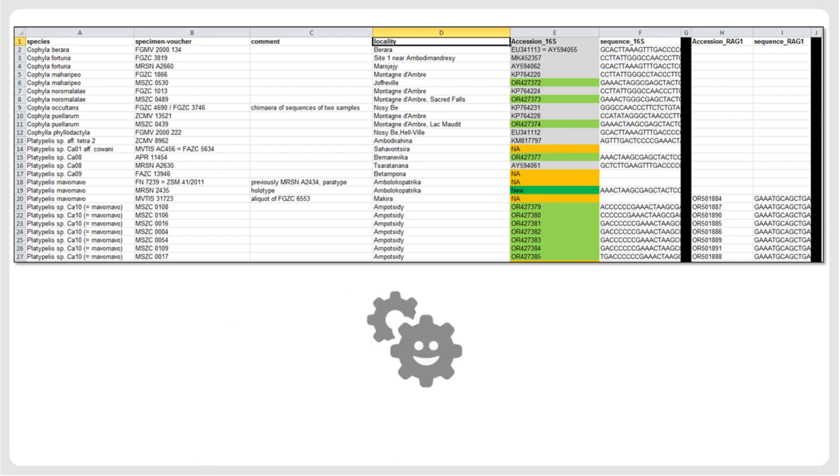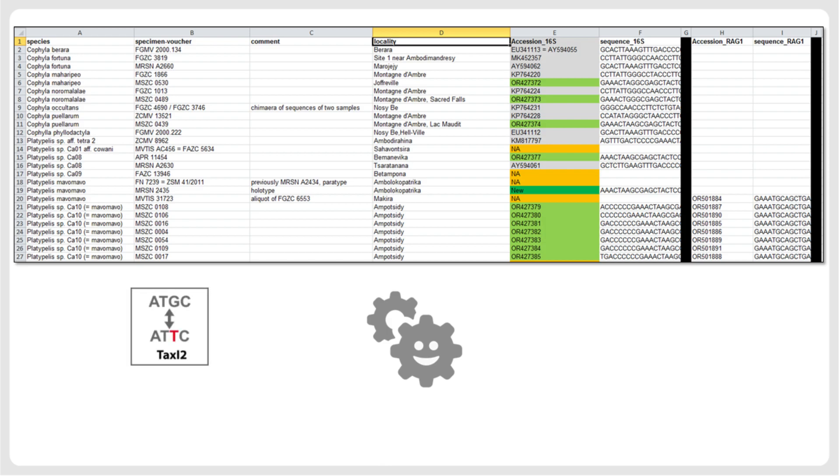Most importantly, once your sequences are organized and curated in a spreadsheet, you can export them in TSV format, which then serves as a convenient input format for various tools in the iTaxoTools project. For example, if you have multiple sequences per species, and the species information is included in a column of your spreadsheet, you can use Taxi2 to calculate mean pairwise genetic distances between species.